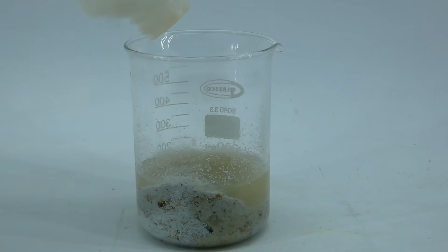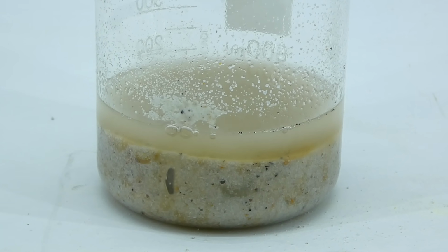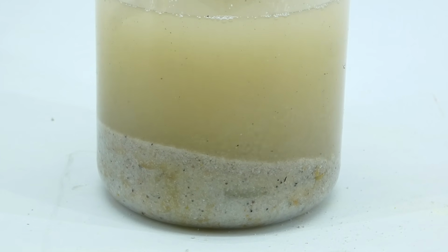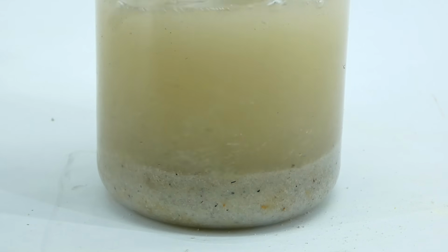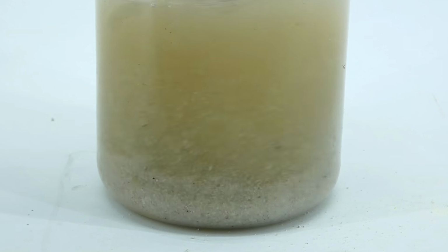What I wanted to see was a complete dissolvement of the material, but instead, only about half of it disappeared, and the other half stayed behind. This was partially a good sign, since the sodium silicate is soluble in water, but since not everything dissolved, it told me that there was less sodium hydroxide than necessary to react with everything.